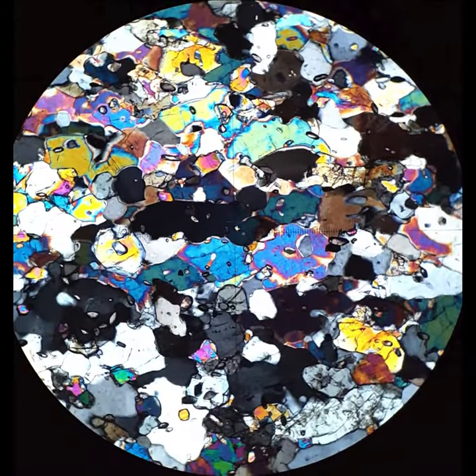Looks just like quartz in plain polarized light or very similar, cross the polars and it has those intense interference colors.